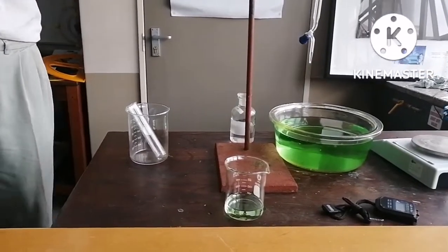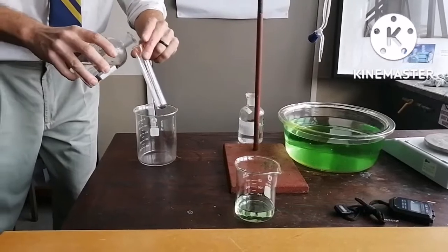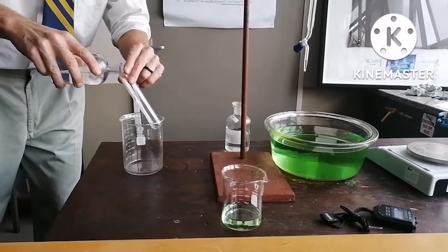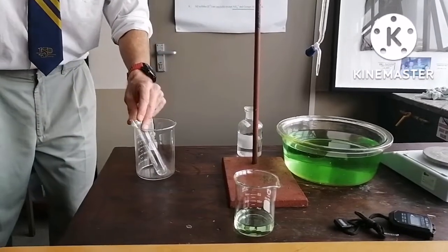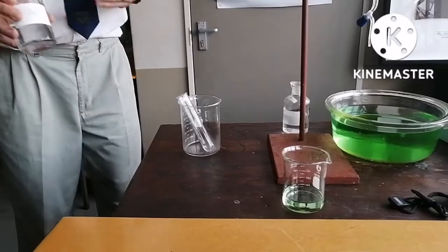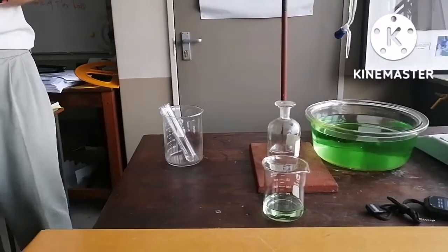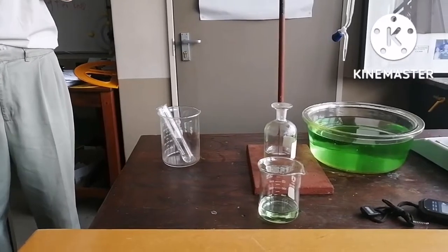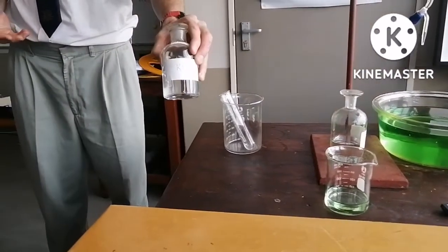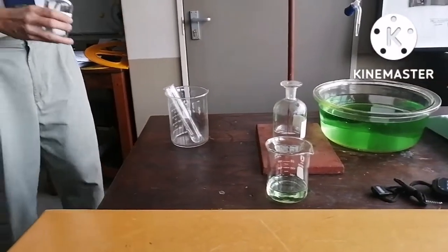Okay, so just let me show you. The precipitation reaction, right? So we've got two aqueous solutions. This is lead nitrate, Pb(NO3)2, and it is a clear aqueous solution. Then I've got potassium iodide, again a clear aqueous solution.